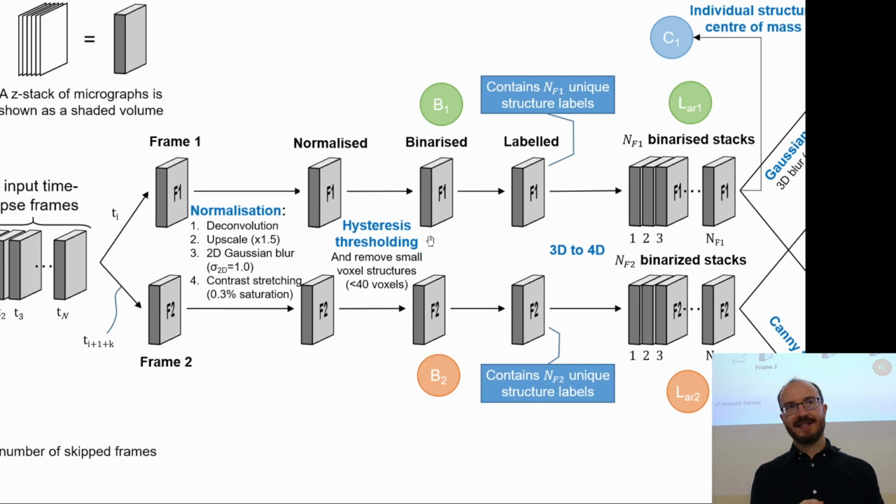But now in our case, we don't have such a clear separation between foreground and background because I've got all of this extra blurriness. So I would rather say there is a point where I definitely know an intensity above this is definitely foreground, so always include this. And then there's another point where I say everything below this is definitely background. But in this middle region, I'm unsure.